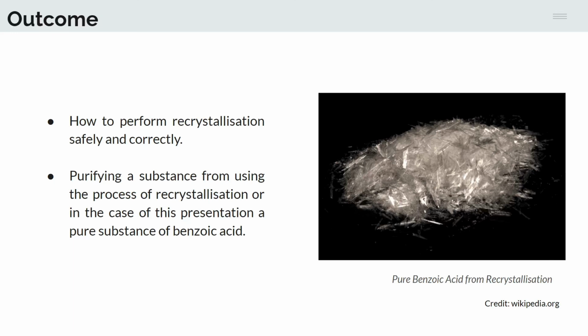Also on the right is just a little reference image for the benzoic acid crystals from Wikipedia, and that just shows how clear and fine they are. From this particular procedure, you might not get such a huge amount that's seen in the image, but it's still the same sort of appearance.